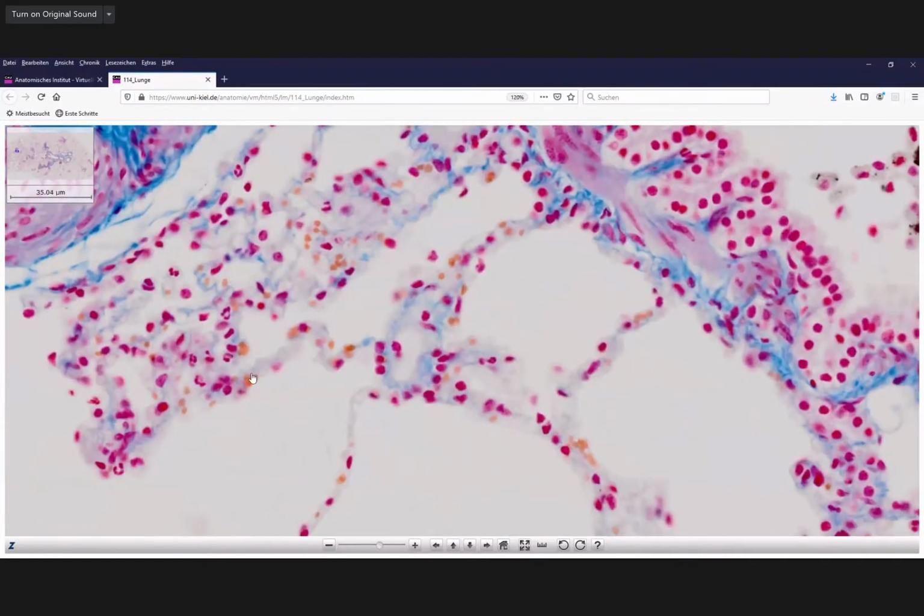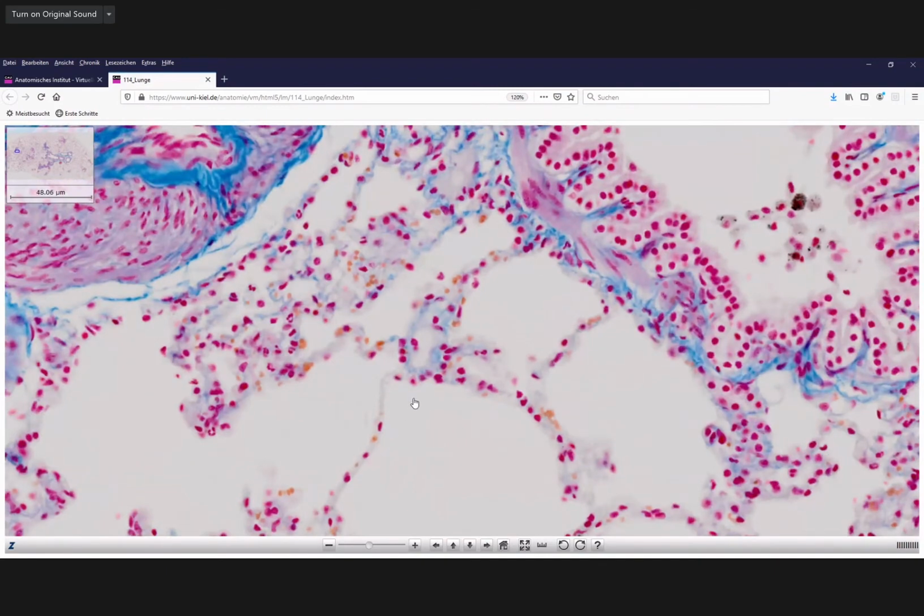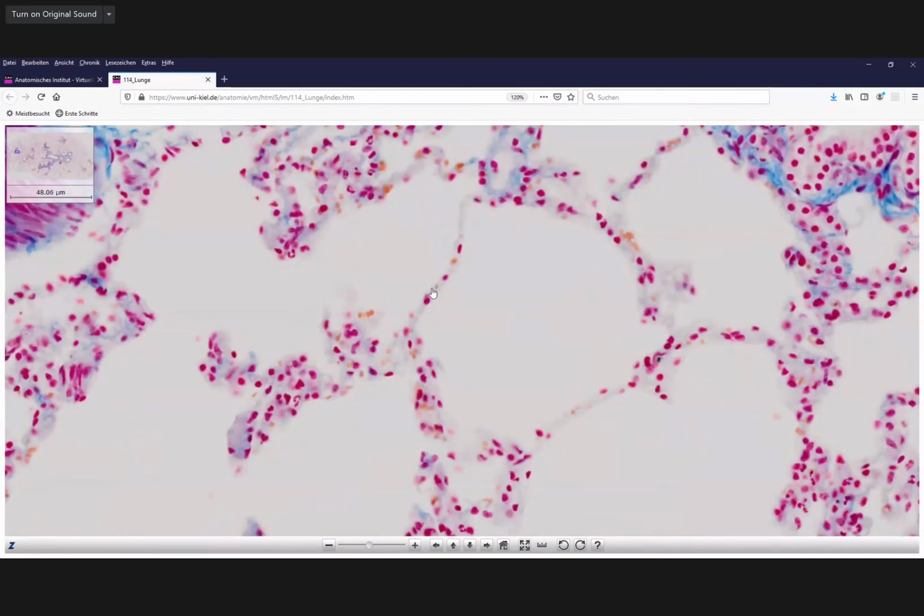So you get an idea already that even in these very small interalveolar septa, and that is how these walls are named, in between neighboring alveoli, you have these walls and they are called a septum. And if you have multiple, you have septa, that's the plural form of septum. And these septa are named interalveolar septa because they are in between these two air-filled spaces.